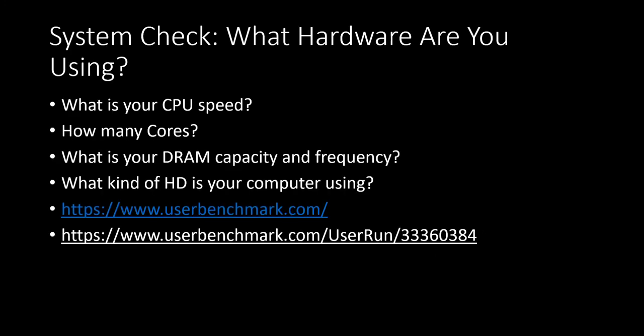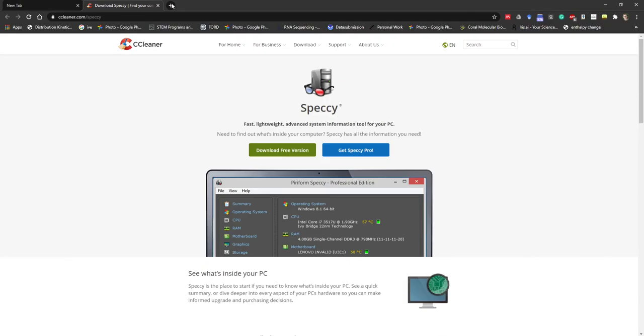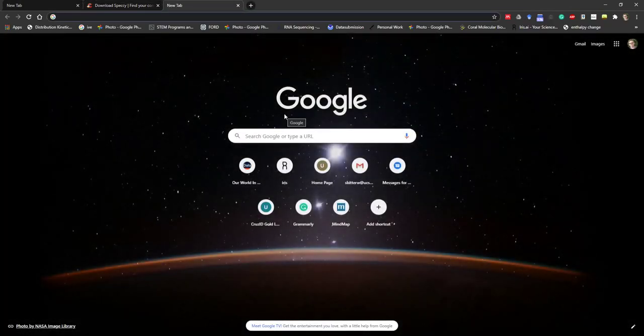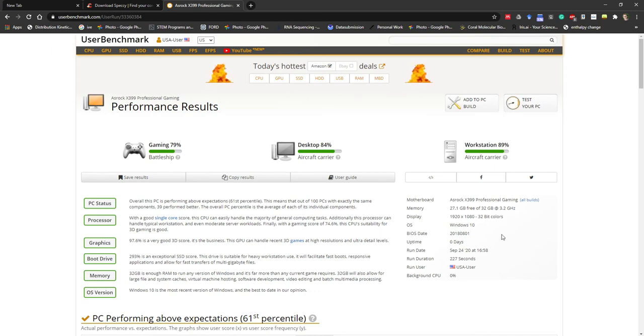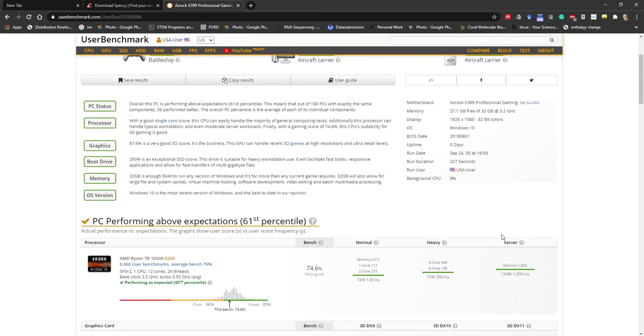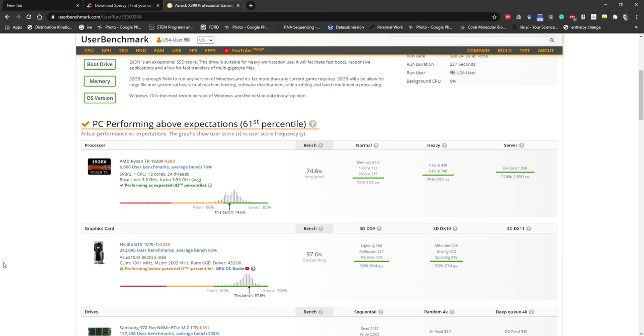Well, one thing I experienced, if you have a 2-core, it takes forever. If you have 8 gigabytes of RAM, it will take forever. In my case, I do 500 samples, 700 samples at a time, so that takes a lot, especially when you go to assigning taxonomy. But supposedly QIIME2 made it a lot faster. I was using QIIME 1.9.1. That's why they have their own formats, like QZA or QZV. I've had a student with less than 8 gigs, and it was able to run on her.